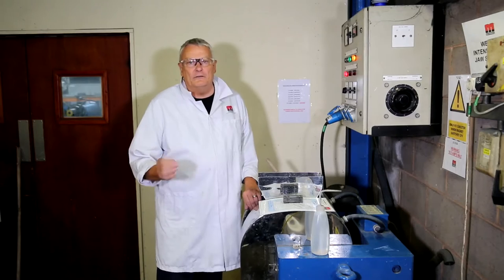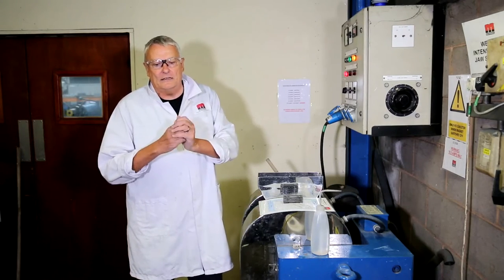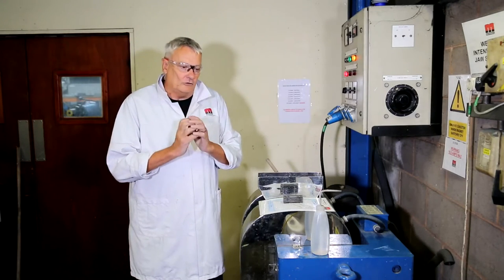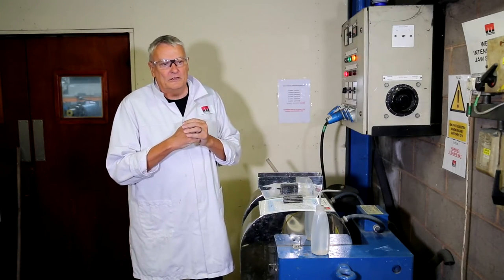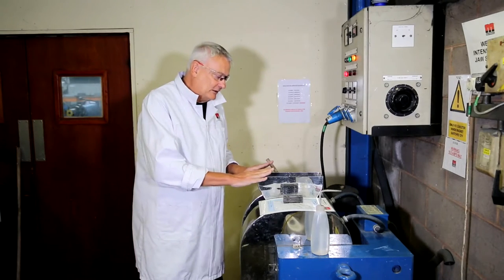The other reason is often when material particles and minerals get very fine, they tend to develop quite a lot of electrostatic charge and clump together and don't flow very well on our dry machines. So often when you get down to a size range below 100 microns, we will often consider processing them as a suspension through a wet magnetic separator like this one.